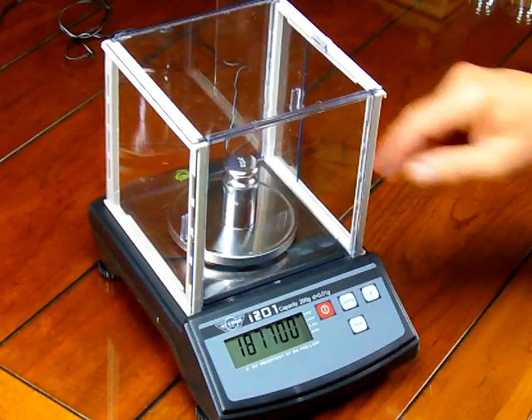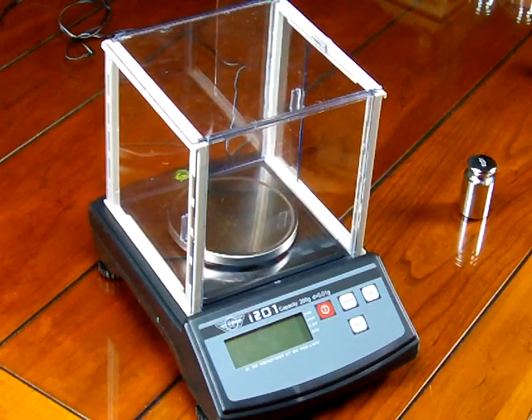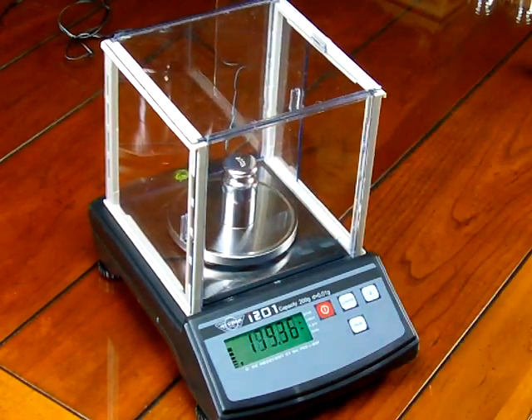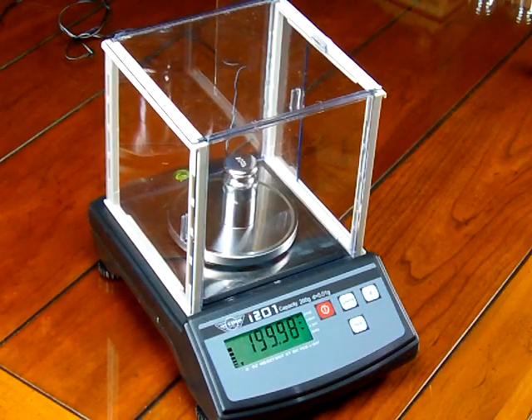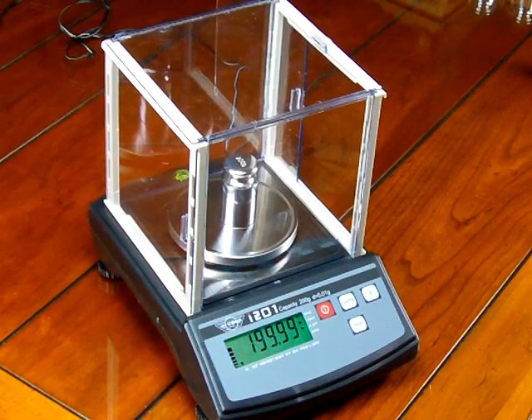Now remove the calibration weight, shut off the scale, then turn the scale back on. The scale will go through its power-up sequence and return to zero point zero zero. If we place our 200 gram weight on the balance, you'll see the scale is now calibrated. Before, we got EEEE because it was in excess of 200 grams — now it reads 199.99. Since the scale increments in 0.01 grams, it's right on the money.